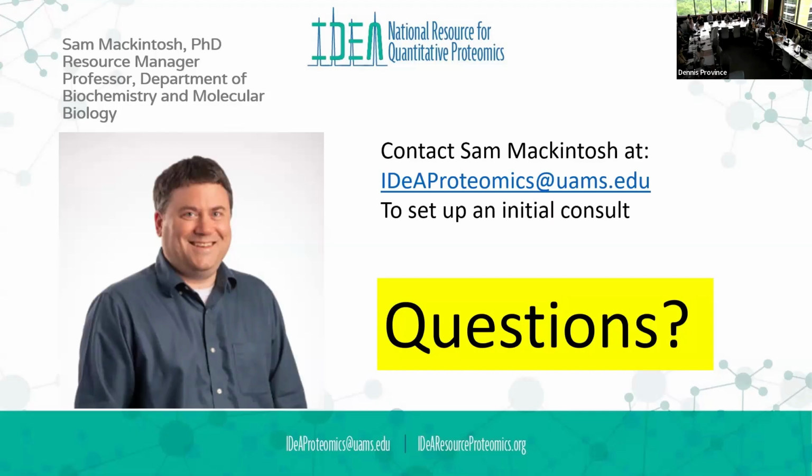Yeah, so that's where you get murky. If you have non-tryptic cleavage, splicing or cutting, we need to tell the database searching software to look for those things, which turns an easier task into a very complicated task, because now all this noise could be a cleavage point here, a cleavage point there.